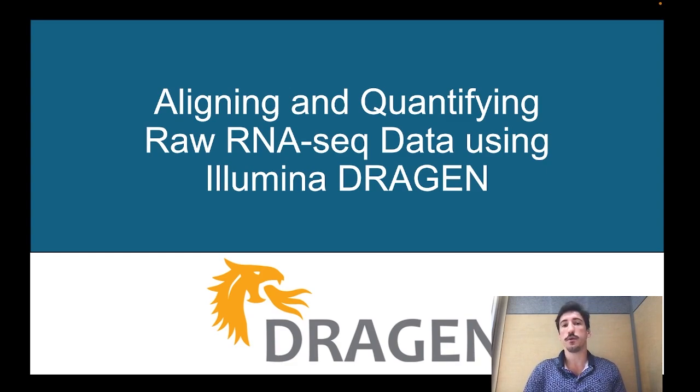Today we're going to be talking about aligning and quantifying raw RNA sequencing data using the platform called Illumina DRAGEN. There are a couple different types of tools you can use to quantify RNA sequencing data, but at least within our lab, we use Illumina DRAGEN because it's fast and ultimately leads to quicker biological insights, and ultimately we think it's worth it, even though it costs a little bit.